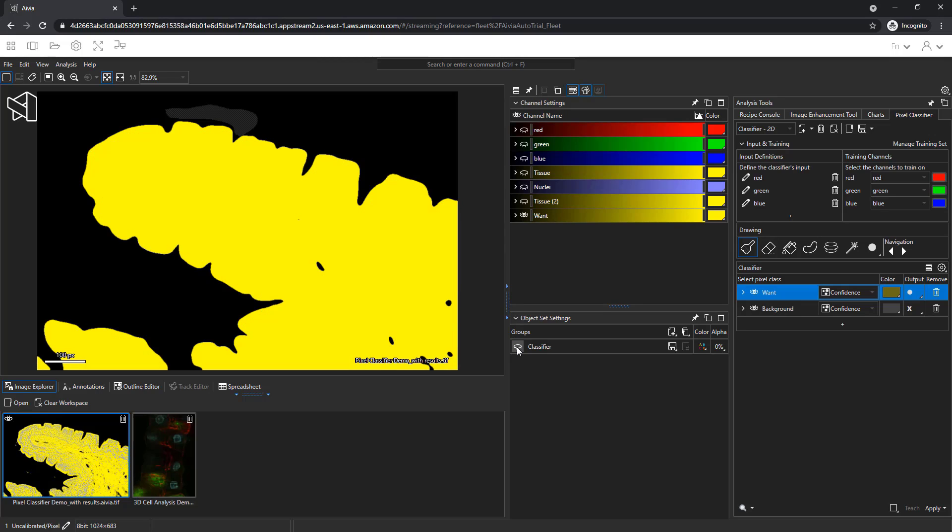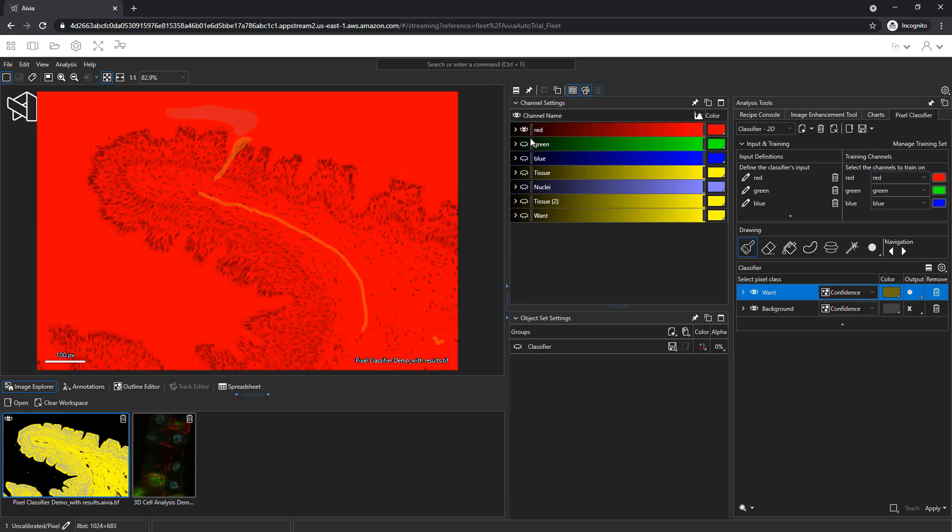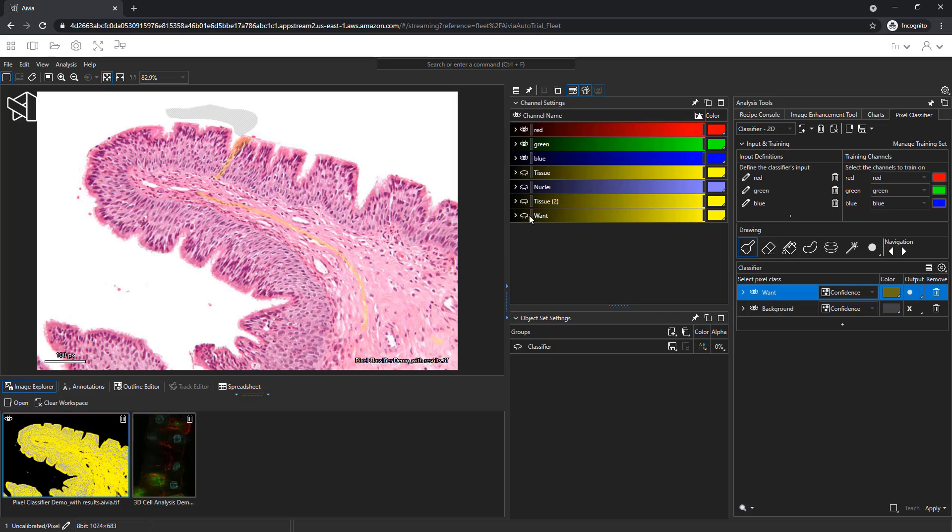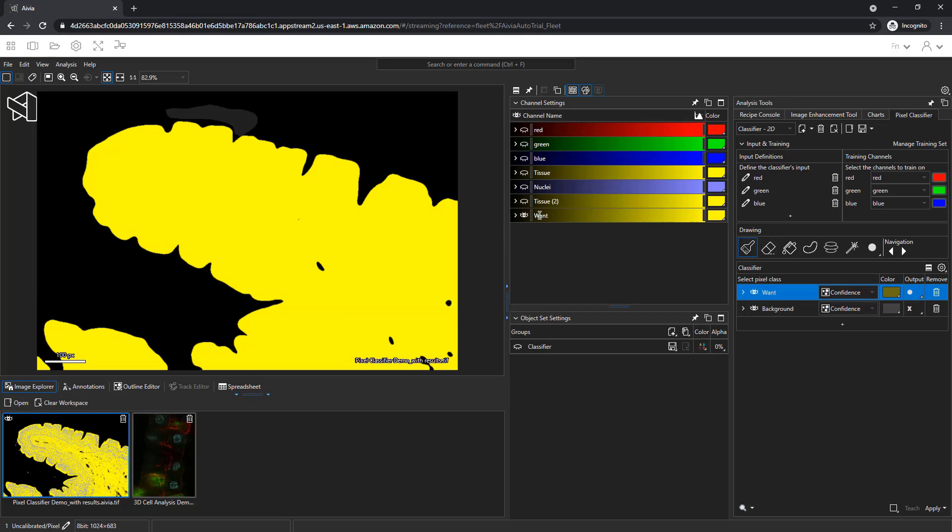I'll turn off the existing object set and turn on the red, green, and blue channels again to see the original image. Clicking on the want channel lets me see the results, which seems to match the original image really well.